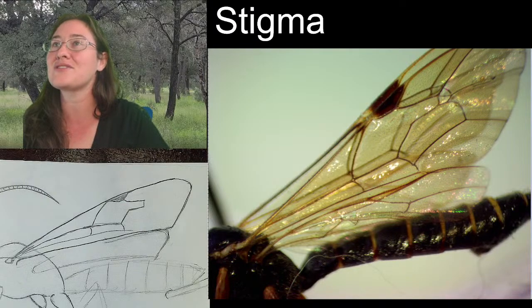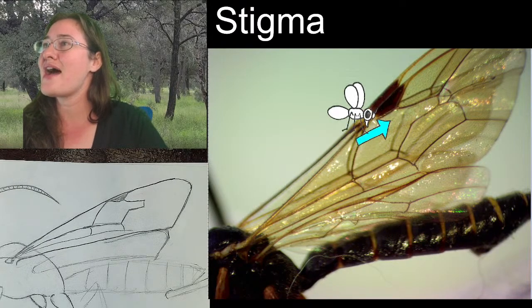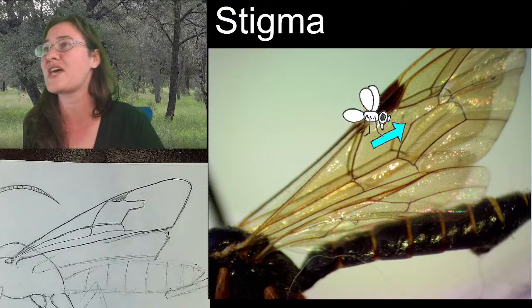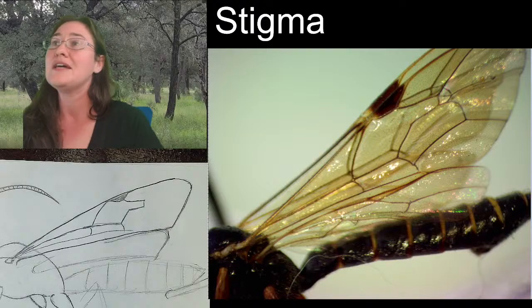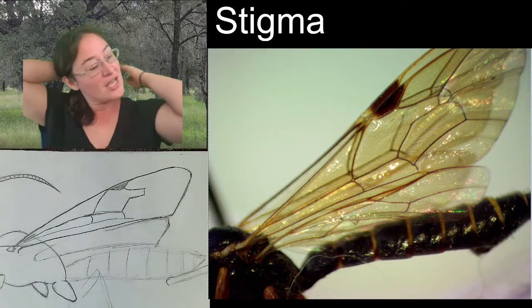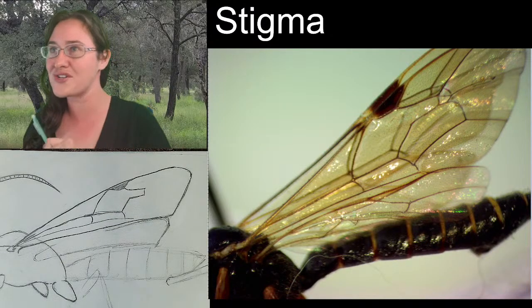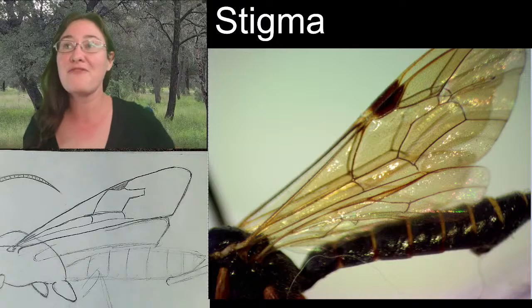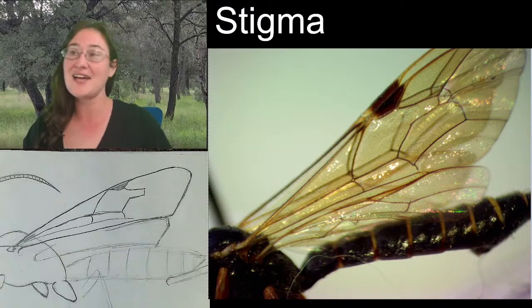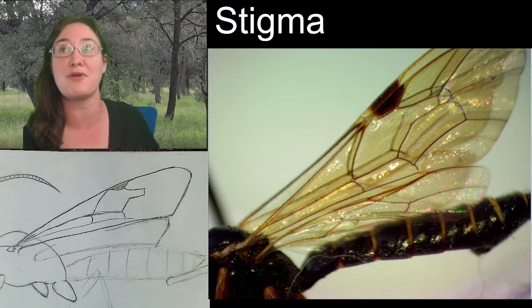And that is right here. And that is our horse head. And that is our descriptive characteristic. If it has a horse head like this, we know that it is an ichneumon. Now, admittedly, because there are so many ichneumonid species out there, there are a handful of ichneumonids that do not have the horse head, but if it does have a horse head, then you know it's an ichneumonid. If it doesn't and it looks like an ichneumonid, it could be either an ichneumon or a braconid.